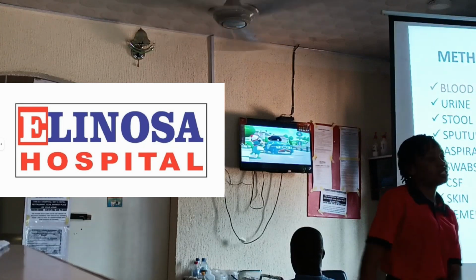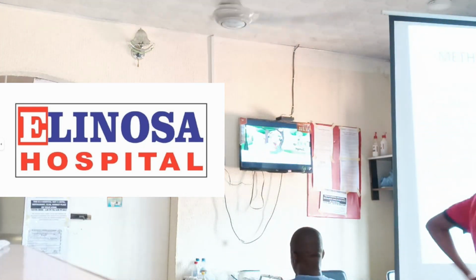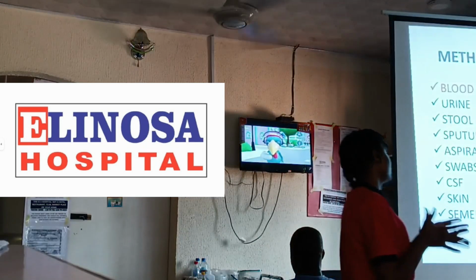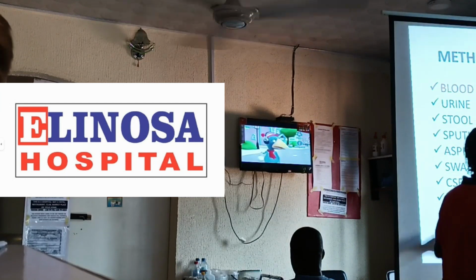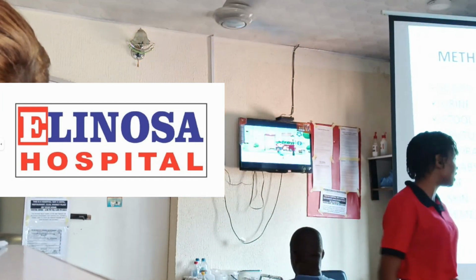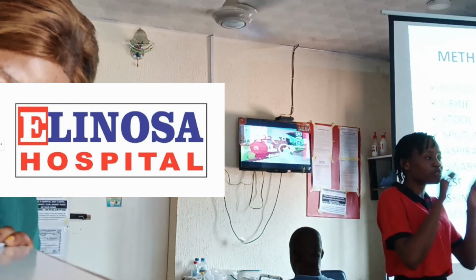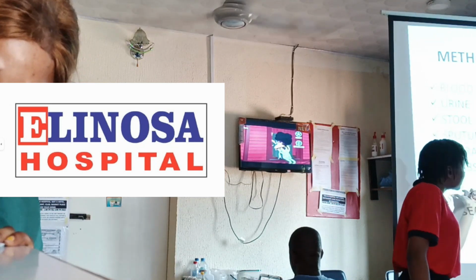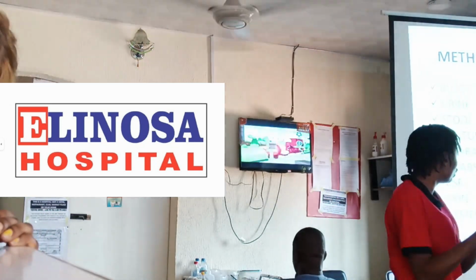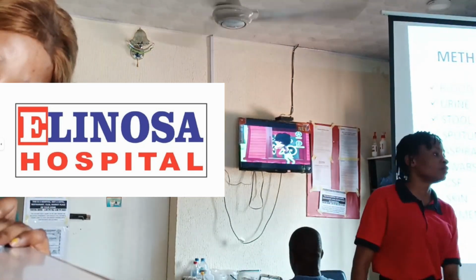Now we also have CSF, known as the cerebrospinal fluid, collected from the vertebral column. This sample is collected by the doctor himself only. Even the scientists cannot collect the sample. And when these samples come into the hospital or the laboratory, they need to be treated with care. Because if you see where this sample is being collected, you will even pity the patients. And most times these samples are minimal in volume. So you have to treat them with what? With caution.